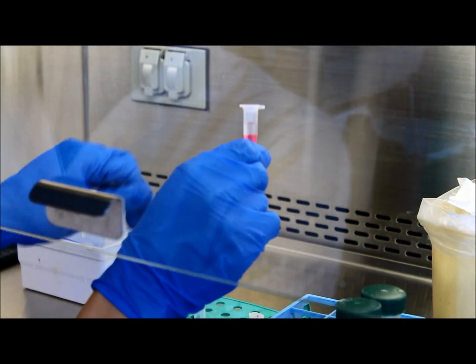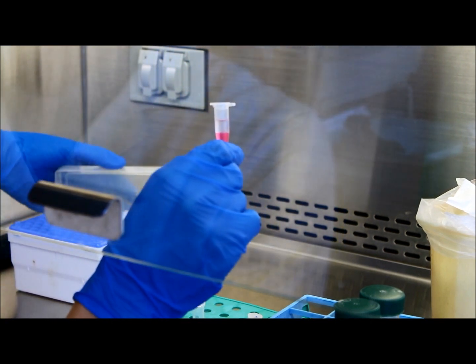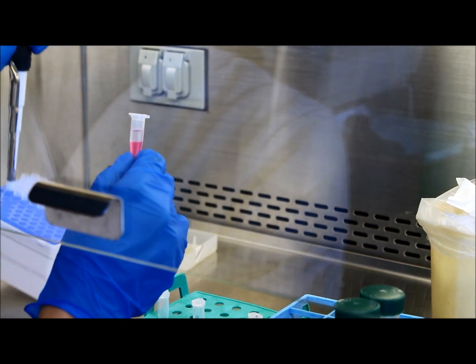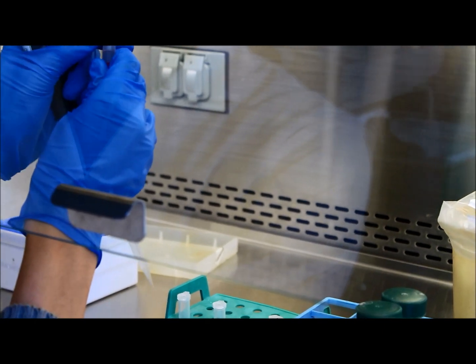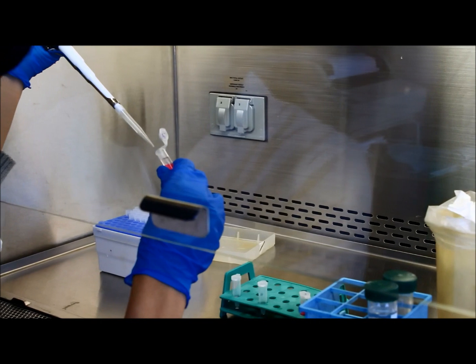By the end of the centrifugation, you should be able to see an upper colorless aqueous phase, an interphase, and lower red organic phase. The RNA in the aqueous layer is carefully removed and transferred to a new tube.